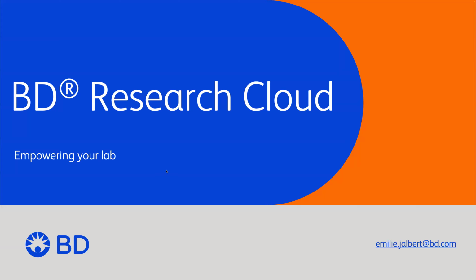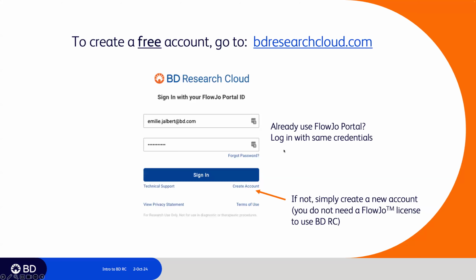Thank you for joining this webinar for BD Research Cloud. If you haven't already created an account, I encourage you to do so and follow along. To create a free account, go to bdresearchcloud.com. This is the login you'll see if you already use the FlowJo portal, where you use an email and password to access FlowJo. You would use the same login for BD Research Cloud.